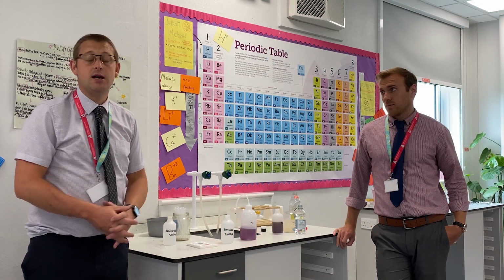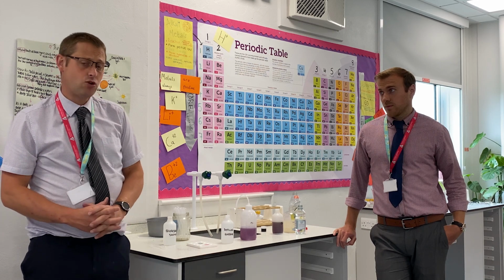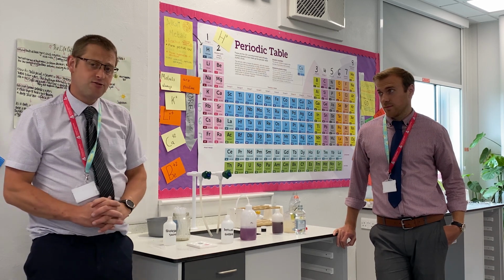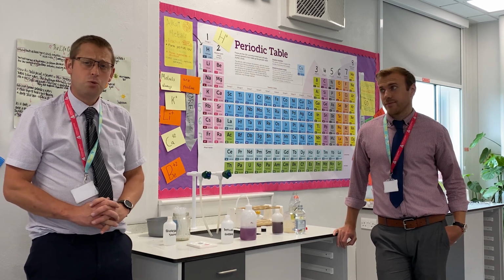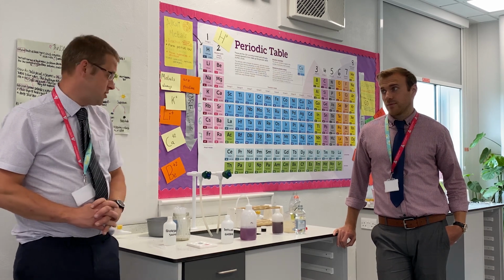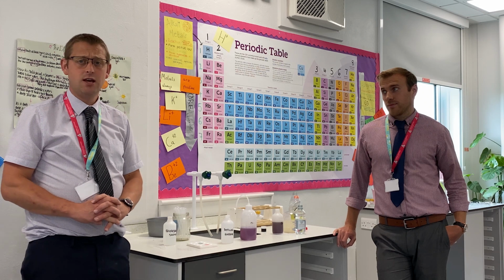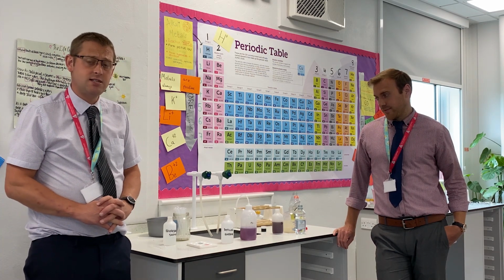Please work out the other substances that you've got in front of you, whether they're acid or alkali, and is there a difference between the colours that you see? Is there any that are particularly darker? Is there any that are particularly lighter? If it's darker, does that mean that the acid is stronger or weaker? If it's lighter, does that mean the alkali is stronger or weaker? Have a little think and a discussion, and note your ideas down on your table.